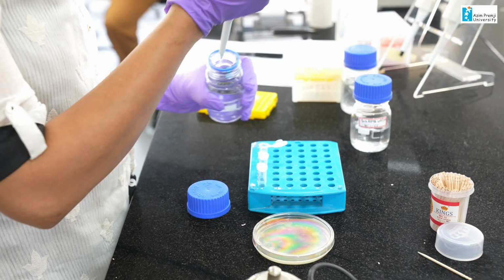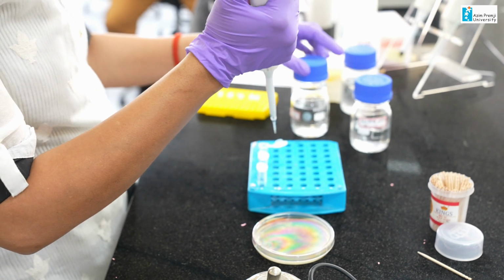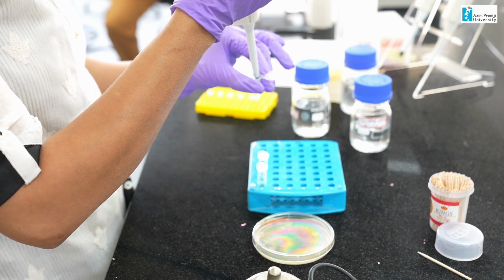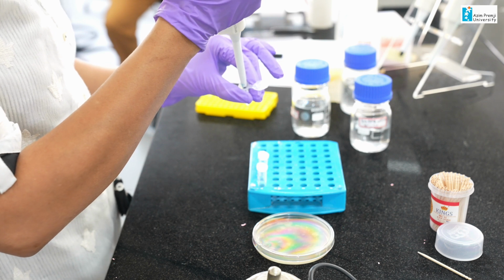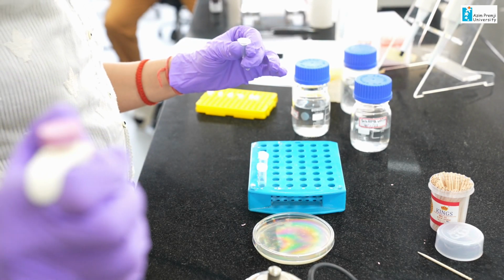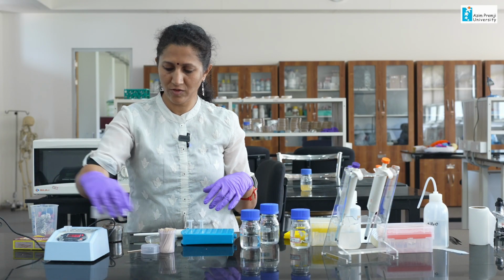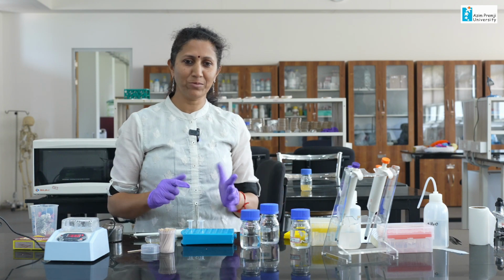I am going to transfer 3 microliters of KOH-EDTA, that is potassium hydroxide, into the bacterial suspension that I have already taken in a tube, and mix it thoroughly. Now, close the lid and incubate in the water bath for 5 minutes. I am going to turn on the timer now.